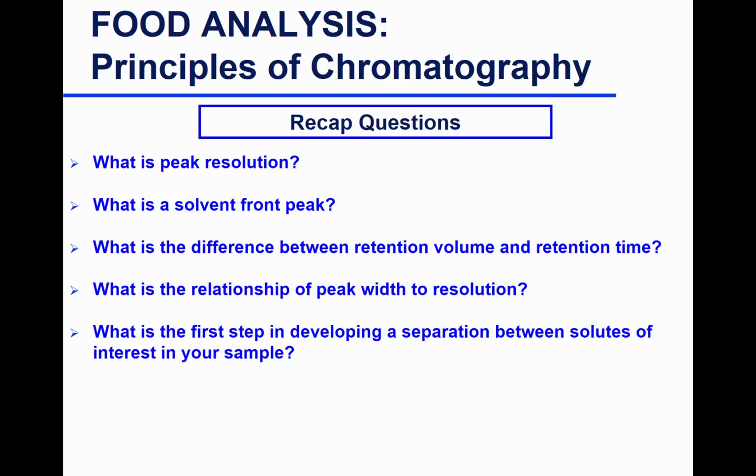I think we were talking about resolution last time. So hopefully some of you get a chance to actually review over the weekend for the quiz coming up. So what is peak resolution?